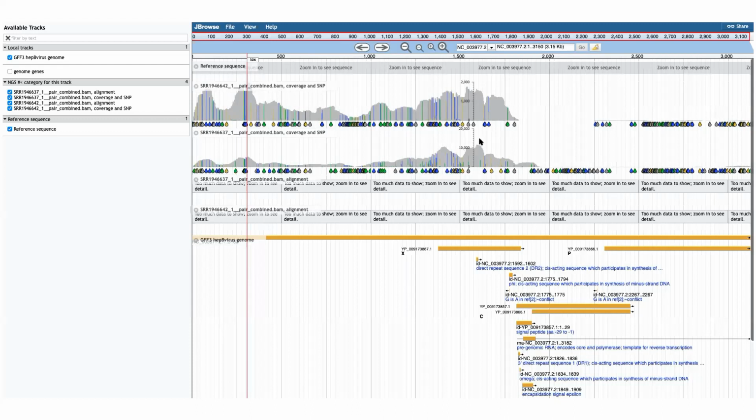But let's take a look. Here we have our scale. The scale is different. Here it is 20,000, here this is 2,000, so the difference is tenfold. That's one difference. This is at about 10,000, this is about 1,500. The other difference, as you can see, is that this stops right here.